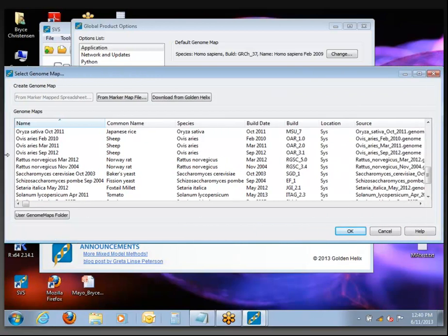If you are using a genome that you don't see in this list, just let us know — we can add it in.